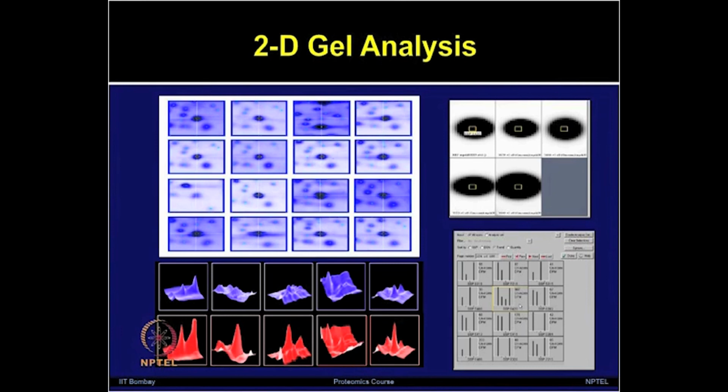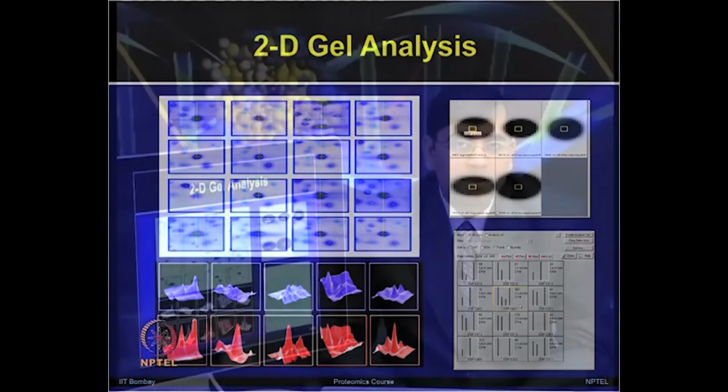So, after looking at 3-dimensional views of this particular protein, you can confidently say that this protein expression is changing and it is going to a higher amount in the treatment. Now, one can look at each of these spot intensities in much detail, and then plot different types of parameters, such as percentage volume or spot intensity, to compare their values and do the statistical comparison.